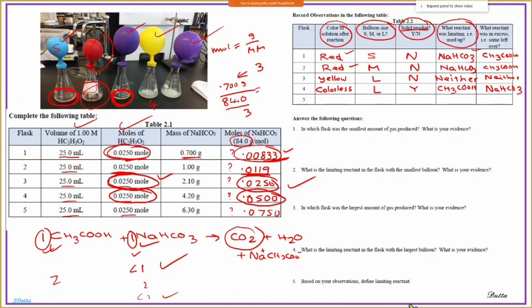So at the end, you're going to write what is, based on your observation, the limiting reagent. Limiting reagent again is the reactant or reagent that runs out first. That reagent will determine the actual amount of the product, which is extremely important for 1150.